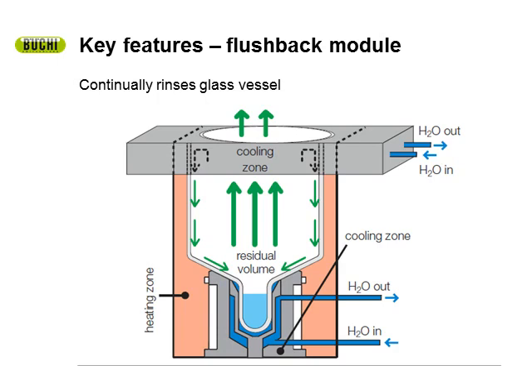So if this flushback module wasn't present, customers would take the glass vessel out, squirt it down with additional solvent to rinse down the walls and have it all flow back into the appendage before they pipette it out. Now with the flushback module, it automates this process. And it does it with the actual solvent that's being evaporated, so you don't have to use additional solvent.